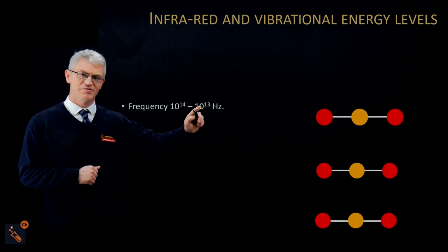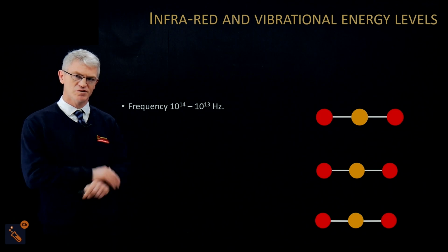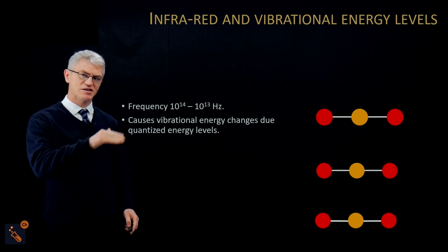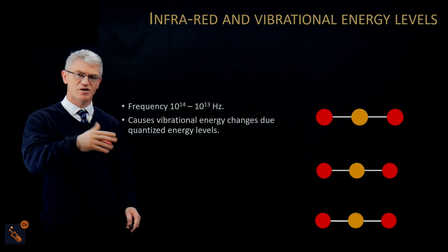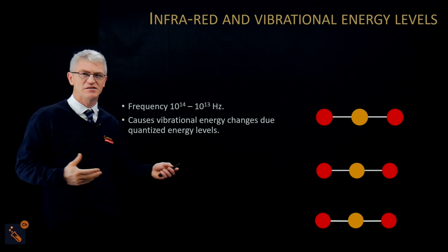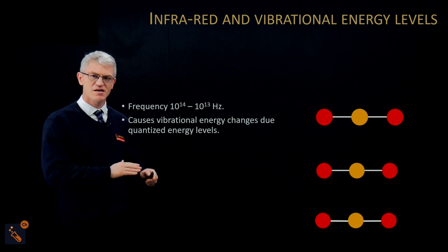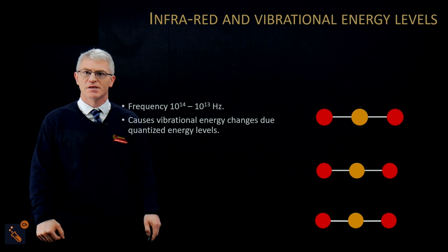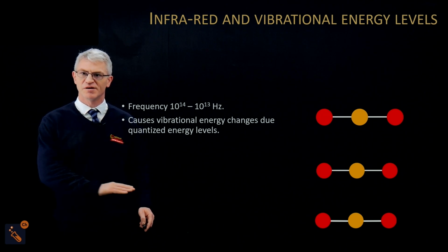Infrared is any radiation within that frequency, but don't worry, you don't need to remember that. It causes vibrational energy changes in the chemicals over quantized energy levels, and that doesn't really matter too much either, but all it means is imagine the molecule is shaking like this, okay? And then it has to go from level 1 to 2.